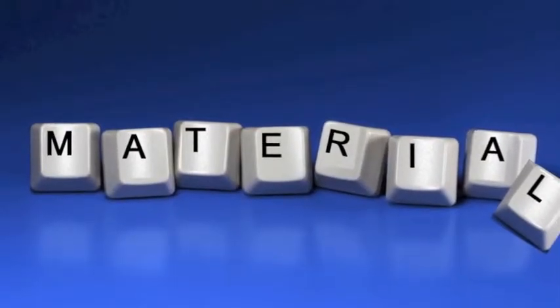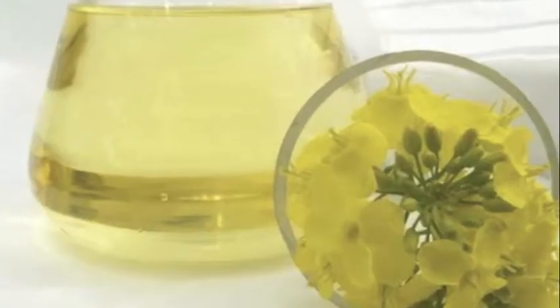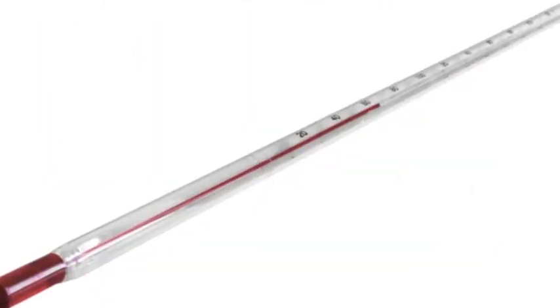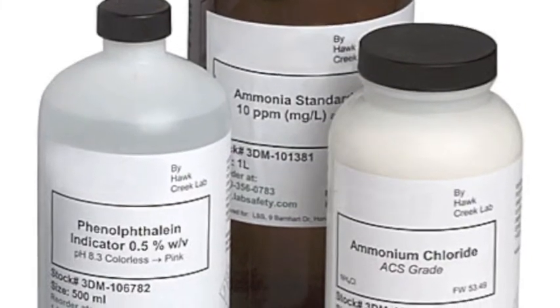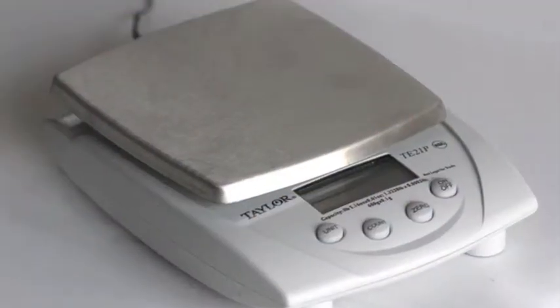The materials you will need are a 2-liter plastic bottle, 1 liter of canola oil, a hot plate, a thermometer, sodium hydroxide, methanol, a spatula, a funnel, a 500-milliliter beaker, and a scale.